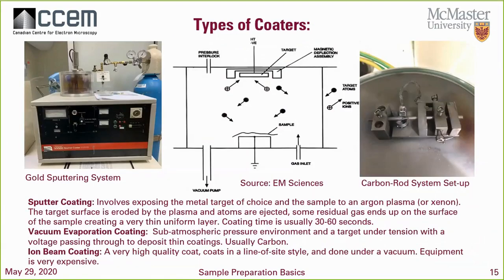Types of coaters. Gold, right? We have a gold sputtering system at the CCEM. We have about four types of coaters at the CCEM. And I want to talk about just these three types, okay? I want to give a little background about them.